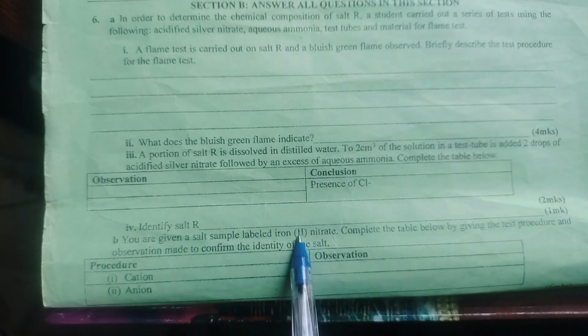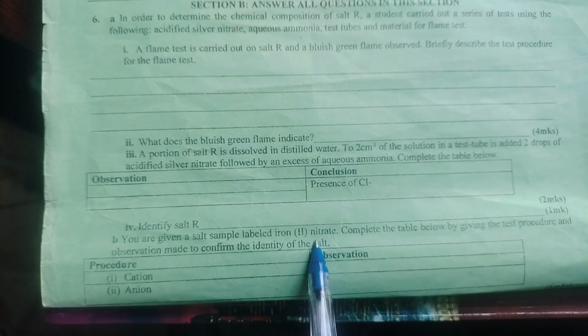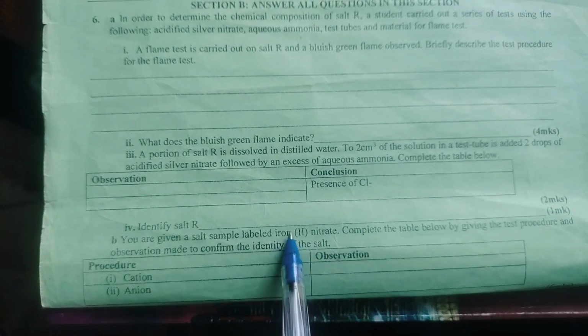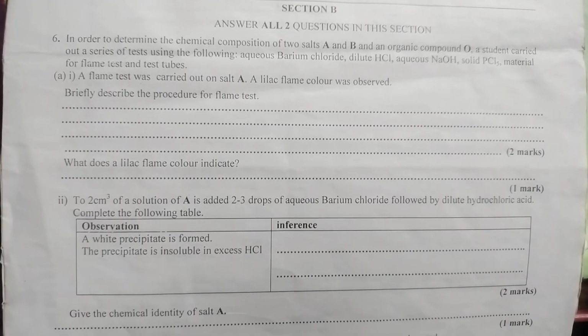If it was iron 3 here, we'll have rust or reddish brown gelatinous precipitate. But since it is iron 2, we have dirty green gelatinous precipitate. What is our anion? The nitrate ion. How do we test for the nitrate ion? We test for the nitrate ion using iron 2 sulfate. From what we saw earlier, we use iron 2 sulfate. And what is the observation? Nitrate, brown ring. We observe a brown ring at the center of the test tube.